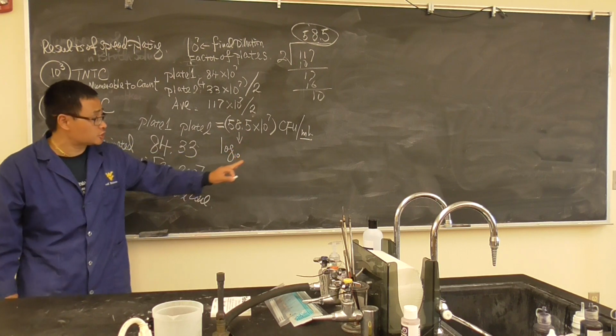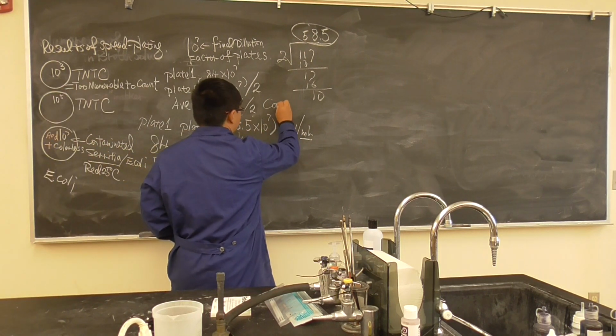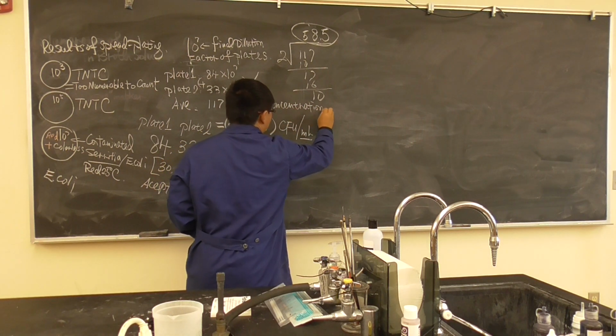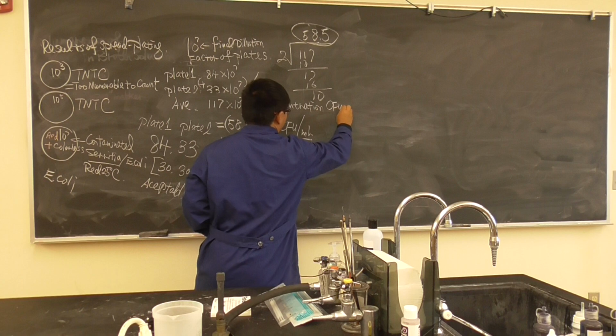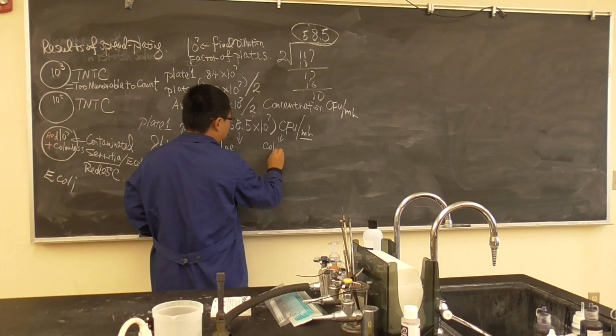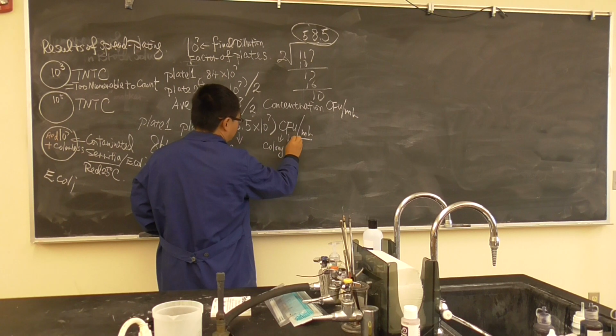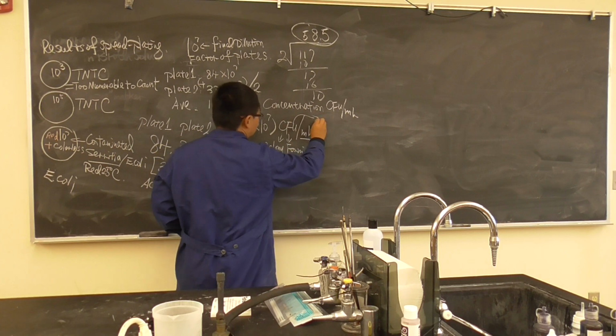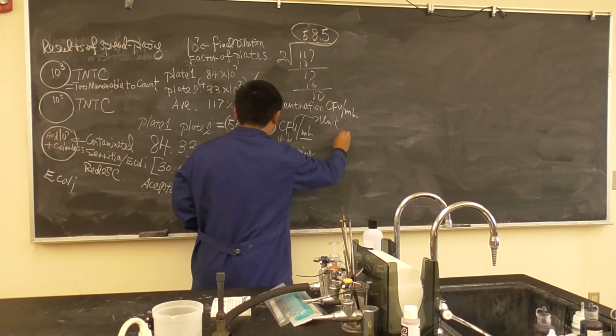It's a concentration. The concentration is always CFU per ml, colony forming unit per ml.